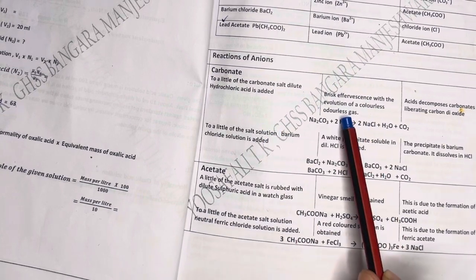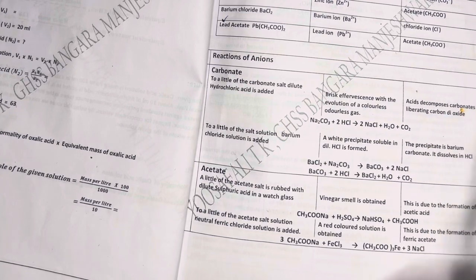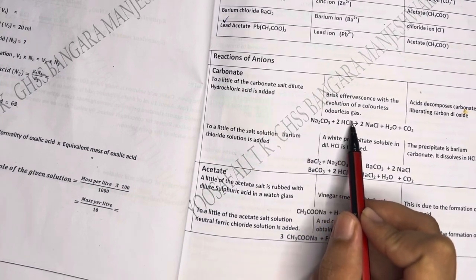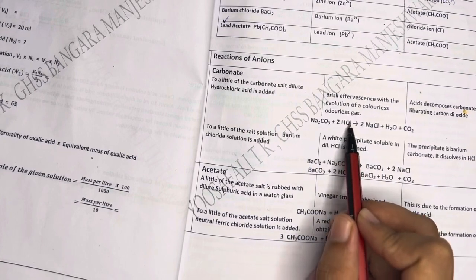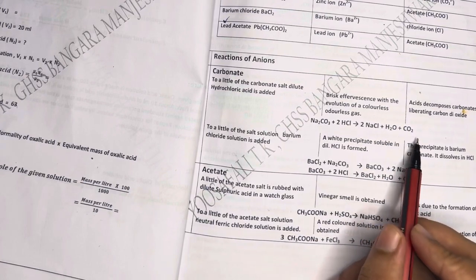If there is a brisk effervescence, then the acid decomposes the salt and carbon dioxide is produced, and this is the reaction. So sodium carbonate, when it is reacting with the HCl, what will be happening? The Cl will be reacting with the Na to form NaCl, along with the elimination of water as well as carbon dioxide.